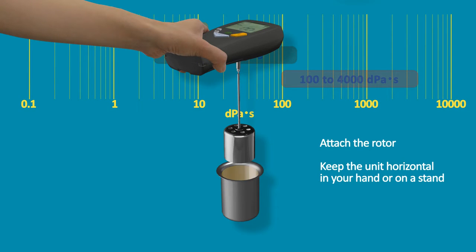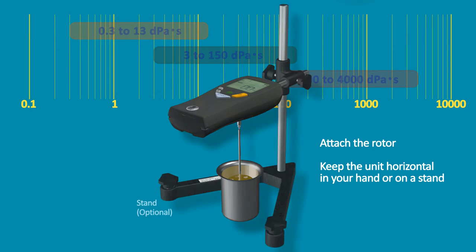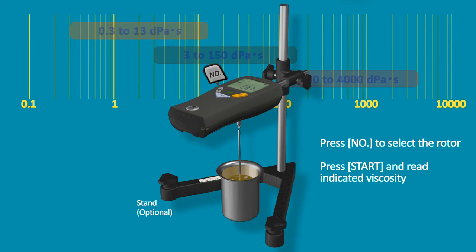Attach the rotor. Keep the unit horizontal in your hand or on a stand. Press the number button to select the rotor. Press Start and read the indicated viscosity.